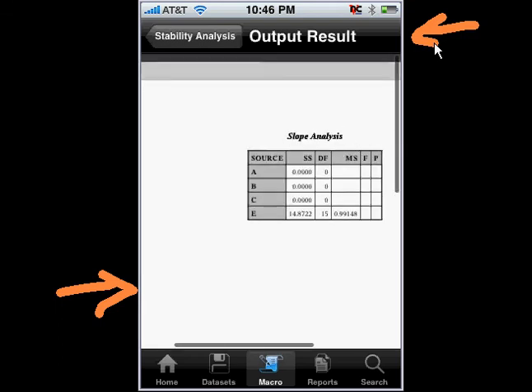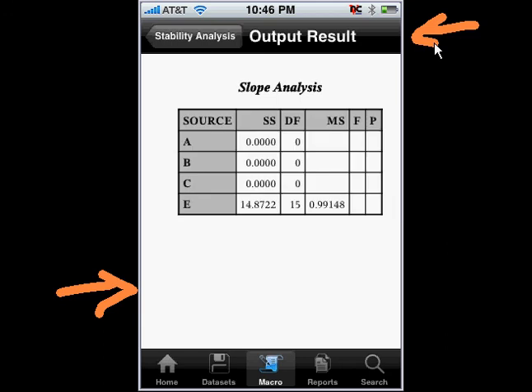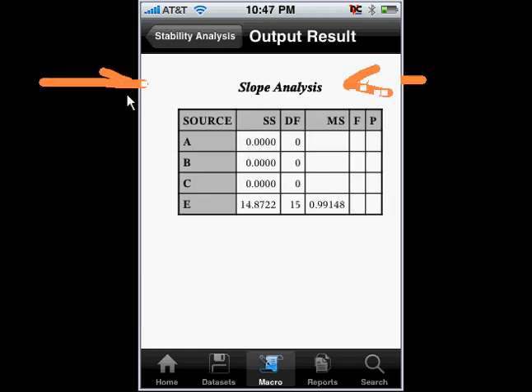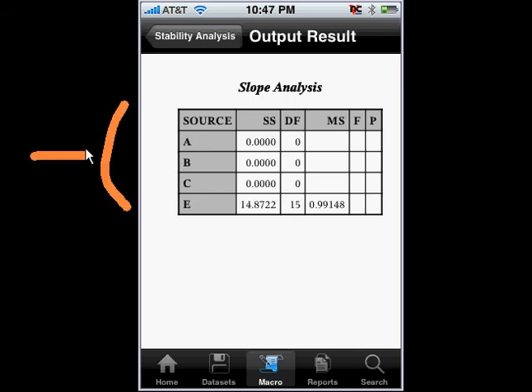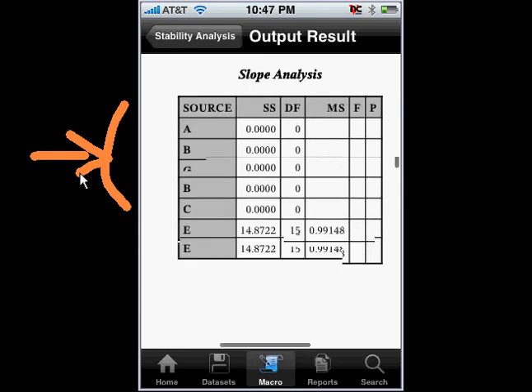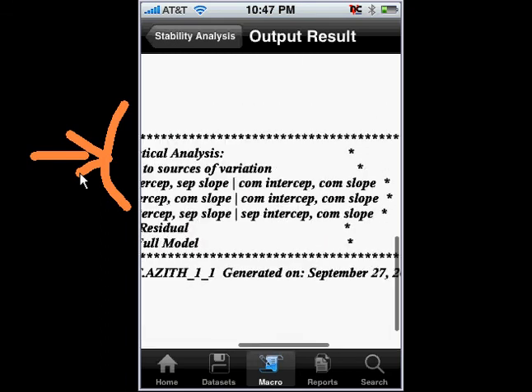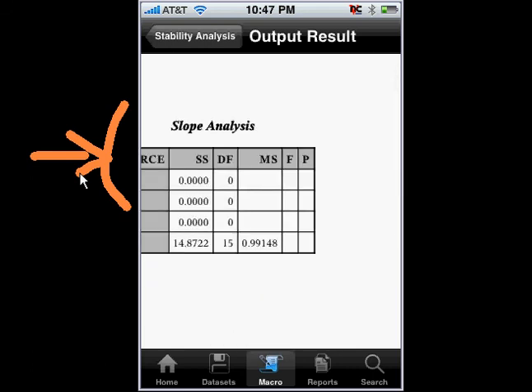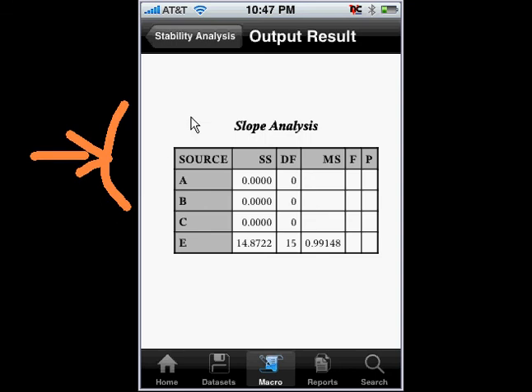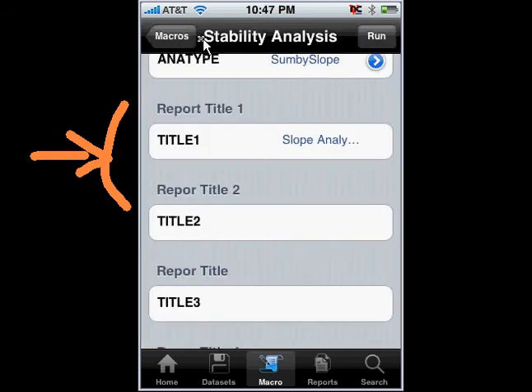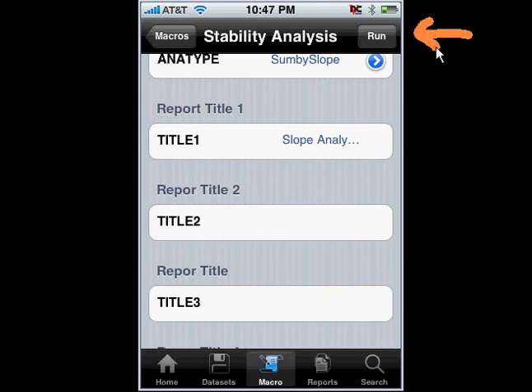As you can see, if I were to zoom in using the pinch, this is the title that I specified earlier — the slope analysis — and the same report that you saw earlier, but only a specific section. The full report we ran earlier displayed all eight pages; this one only contains this one page of this particular analysis. This is how you could dynamically run your reports on the iPhone, and it gets the actual latest information because when you click Run, it executes the analyses, runs the SAS program, and returns the results to your iPhone dynamically. So if you were to have the latest data, you would then get the latest stability analysis.